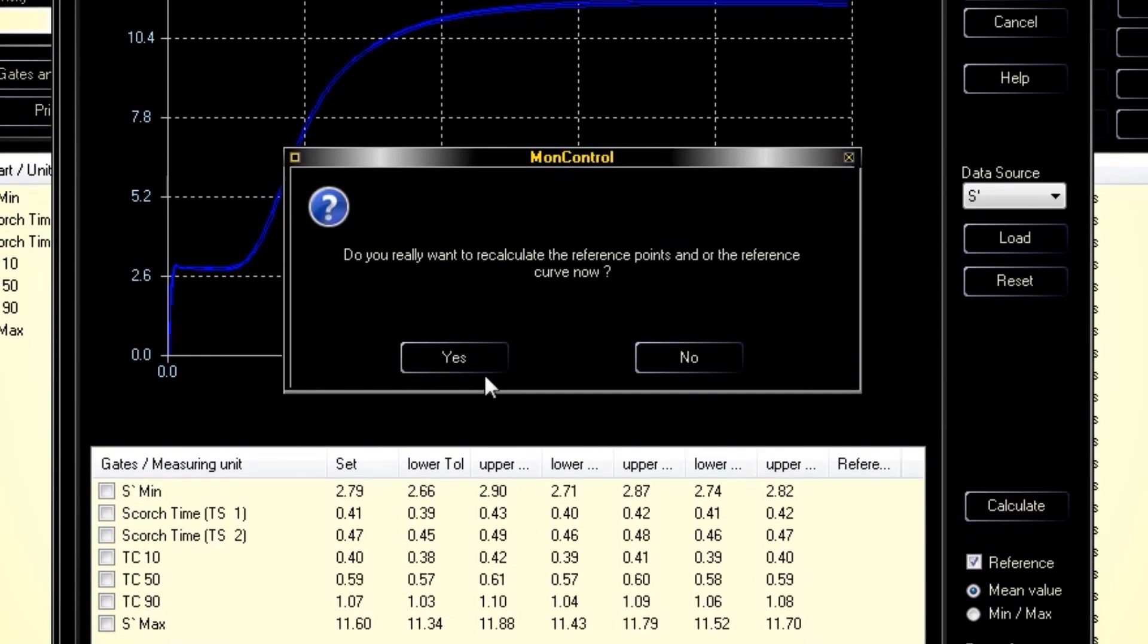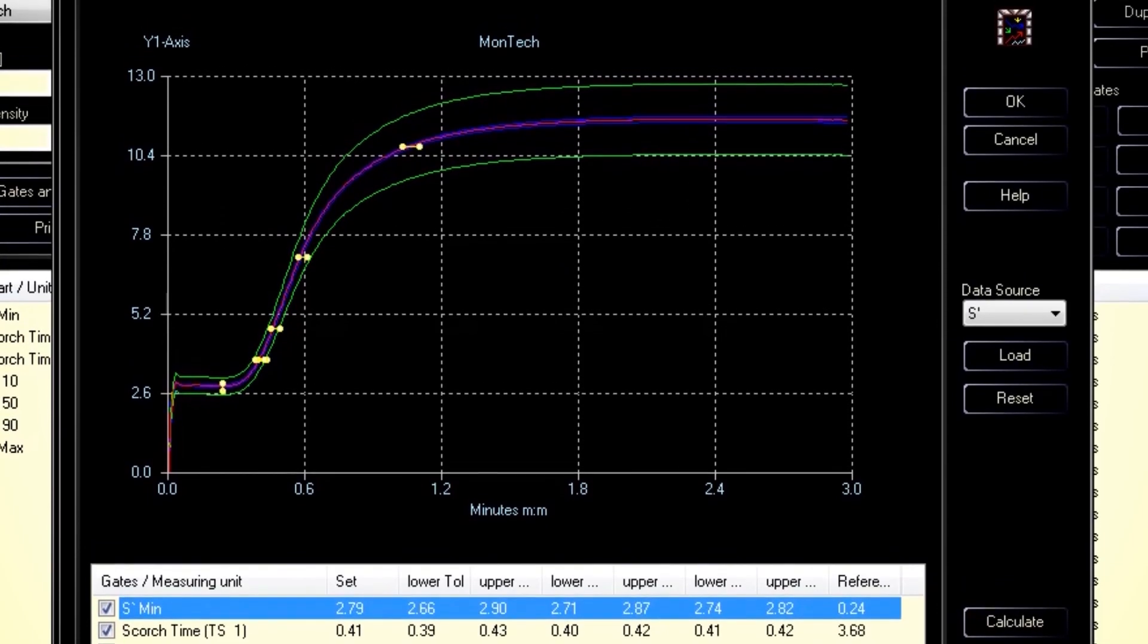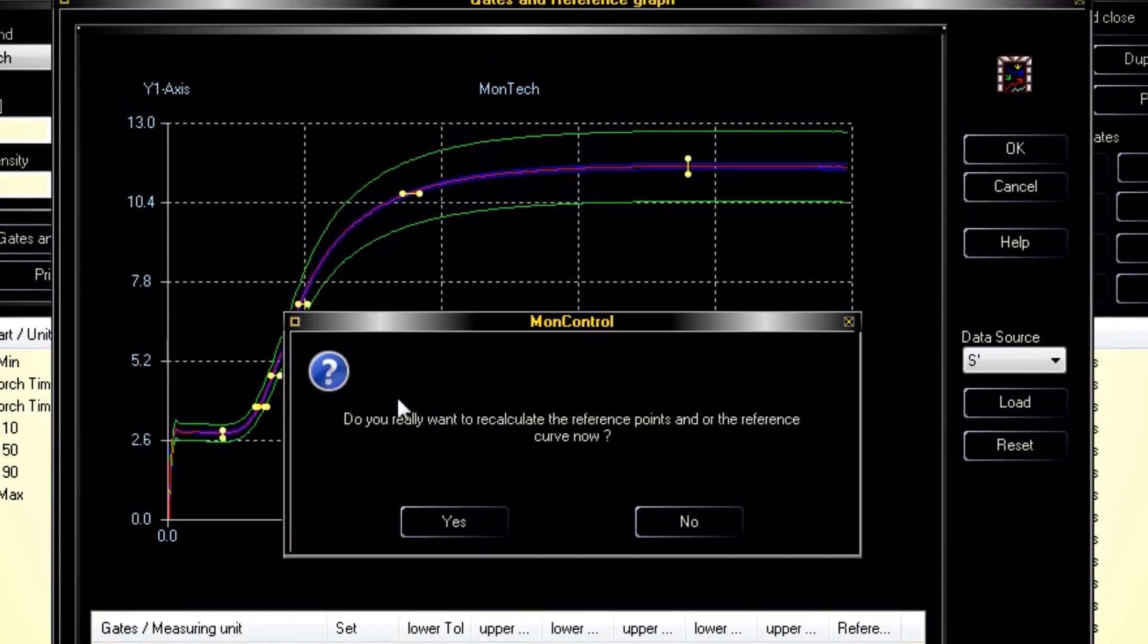A copy of MonViewer software is also included to allow remote compound and test development, and all future software updates are free to the user.